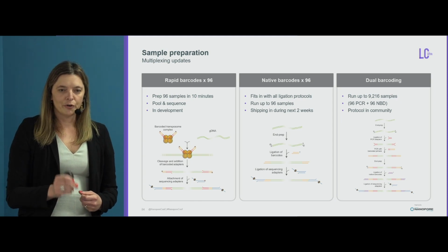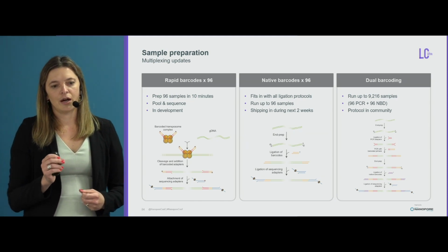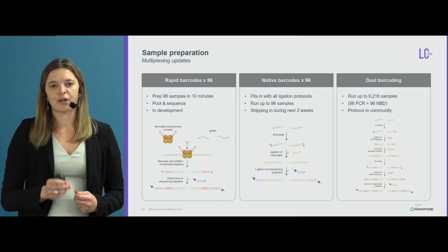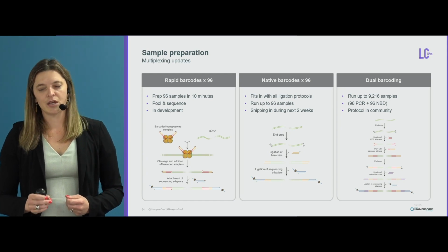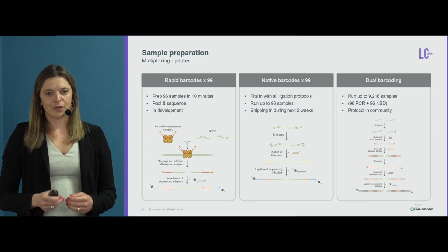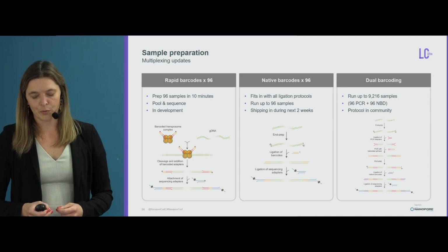Some of you also have your own barcodes, and as such, over the next day or so, we will be releasing the information on how to do custom barcoding in Guppy, so that for those who've already developed barcodes for your own workflows, you can just apply Guppy to deconvolute your samples.